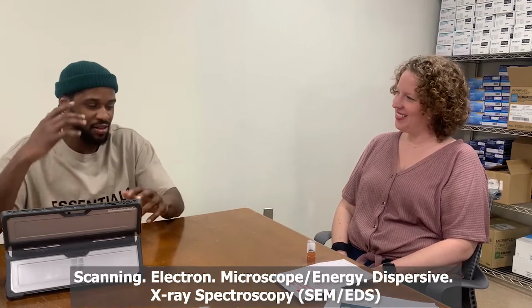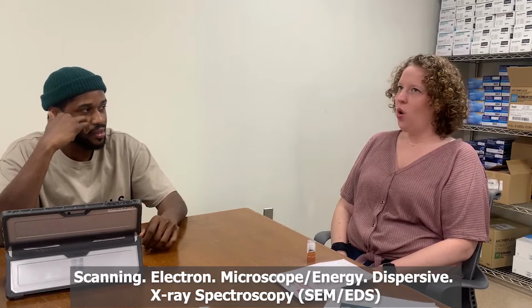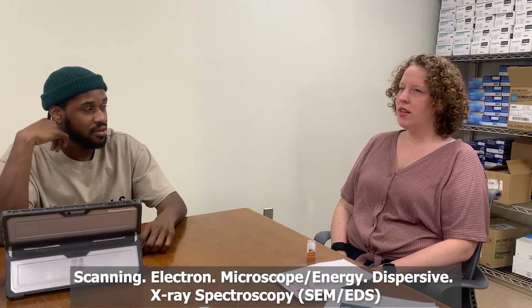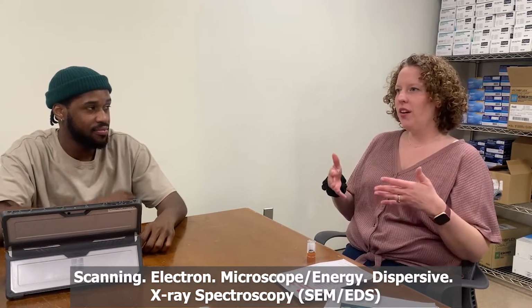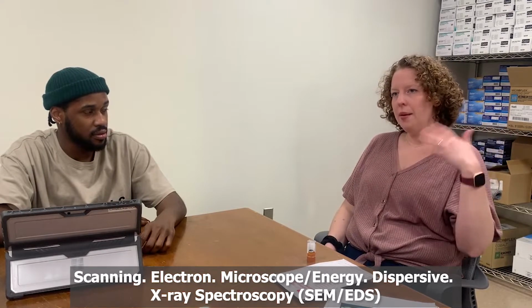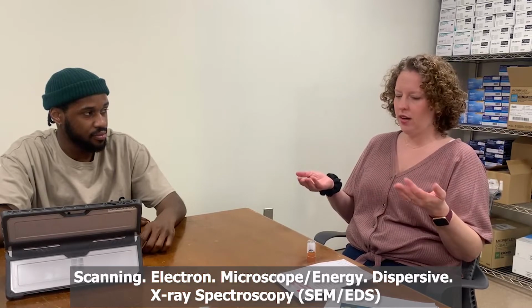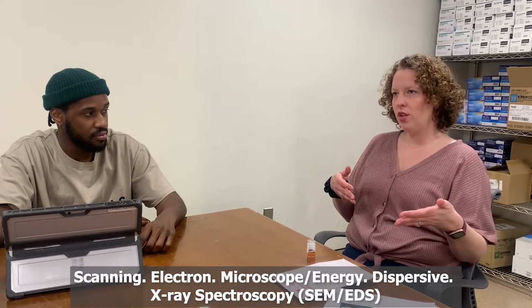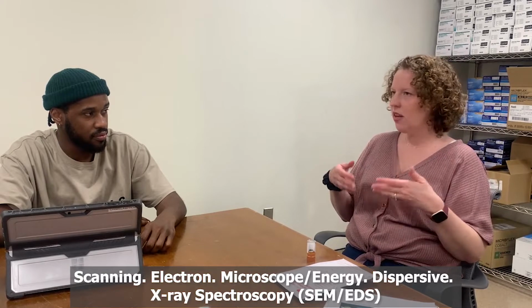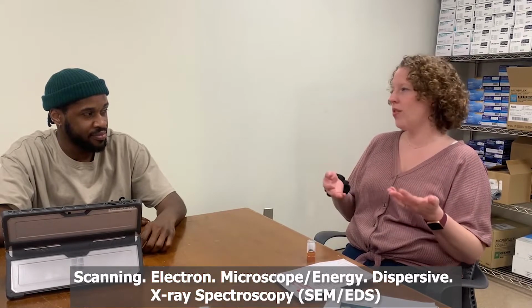So, how does the scanning electron microscope work? Yeah, so basically, the theory behind it is like a light microscope. With a light microscope, you shine light on something, it magnifies it, and so you can see it better. But what the scanning electron microscope does is it uses electrons to get an image of your sample, and it can magnify up to 100,000 times.